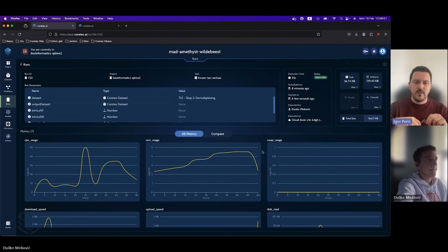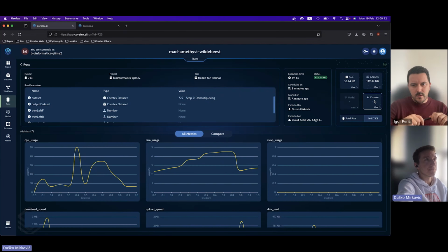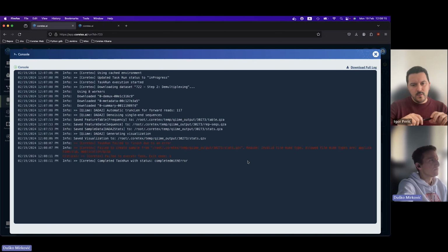Cool. And we already have some artifacts. So what does it say? So it's the denoise output, and it will probably be finishing up soon. Cool. That failed for some reason. It got rejected with the upload. So yeah, it's a detail that needs to be fixed; probably the experiment code was not updated to match what we have with the backend. It was the other way around. So the backend was not updated to match. Okay, that's fine.